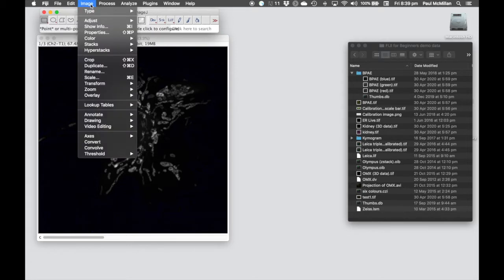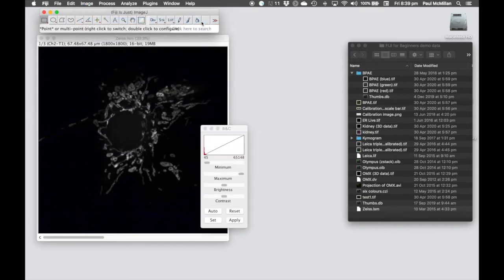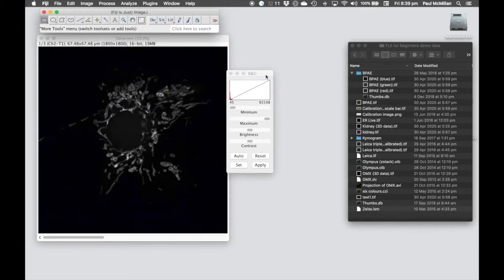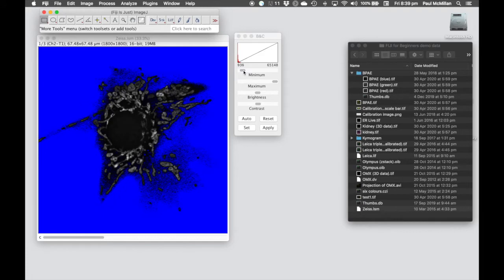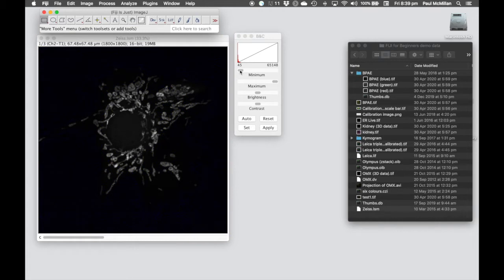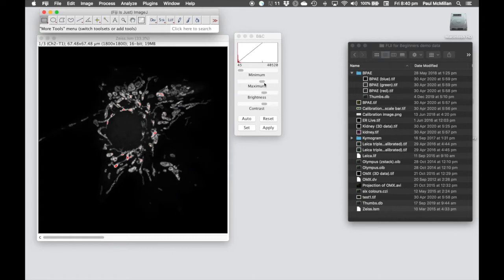To adjust the brightness and contrast, we go to Image, Adjust, Brightness and Contrast, or Control-Shift-C. Here we have our intensity histogram and our maximum and minimum values. If I move the minimum value to the right, we're going past the data and actually starting to clip information, so you want to be very careful about doing that.